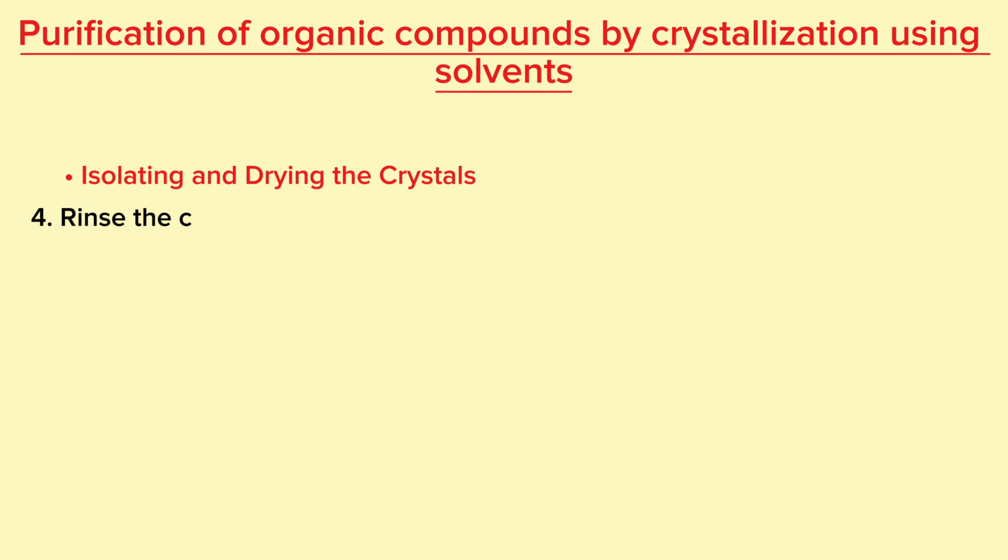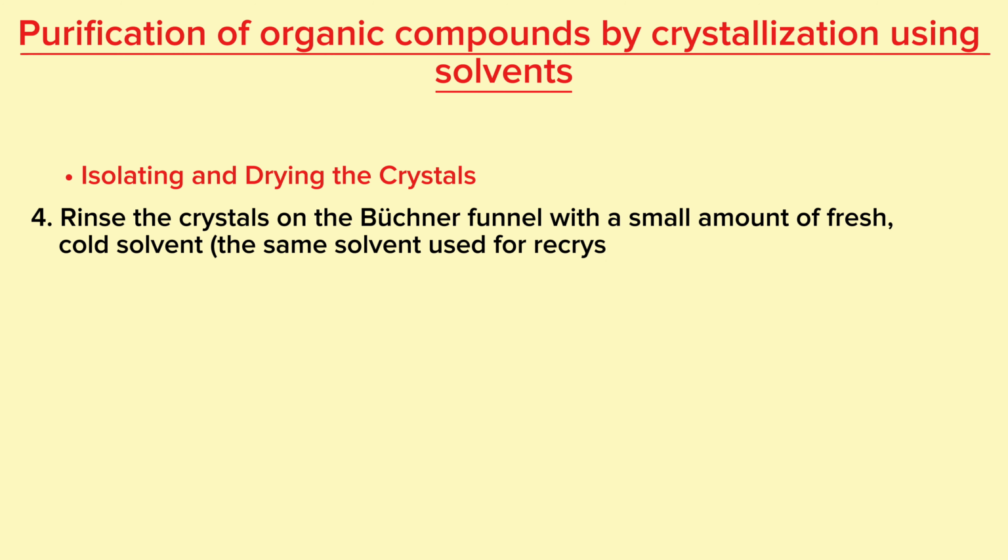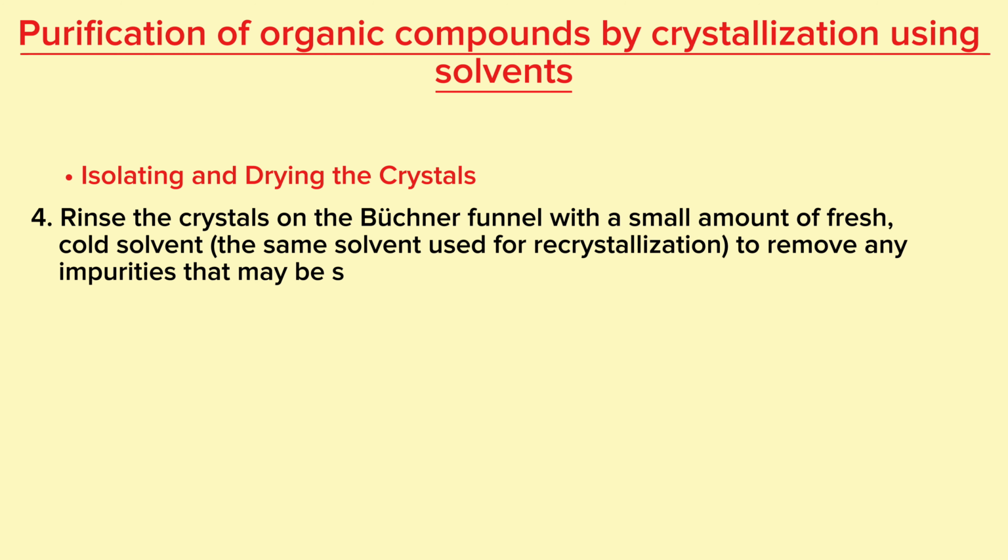Rinse the crystals on the Büchner funnel with a small amount of fresh, cold solvent, the same solvent used for recrystallization, to remove any impurities that may be sticking to the crystals.